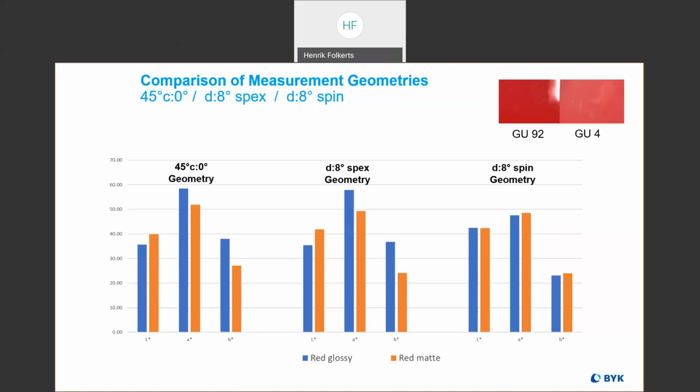Definitely. Yeah, so with our software, or even just in the instrument itself, you can store a standard. You can measure a standard and save it in there, so that you can pull it up anytime you want, and then just take a sample measurement, and it automatically calculates it for you.